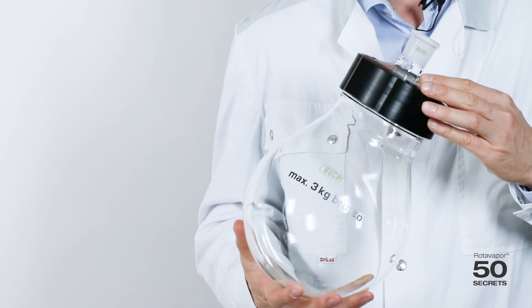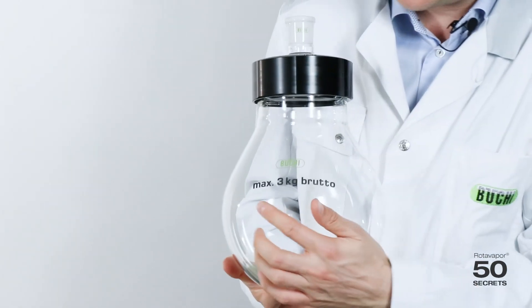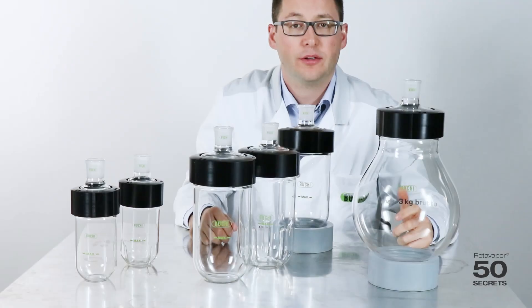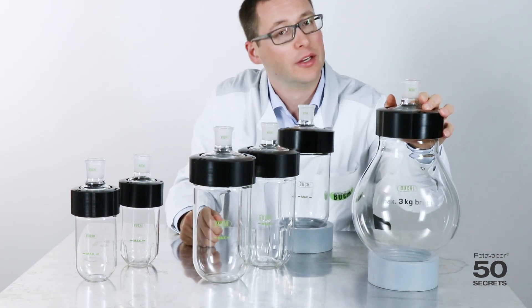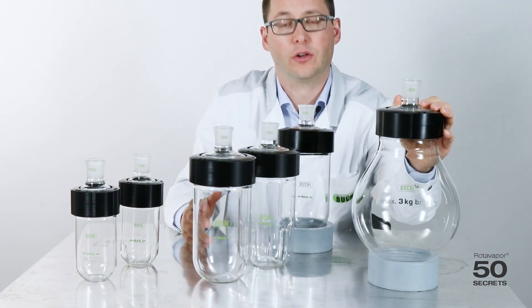Last but not least, the 4 liter beaker flask. The one thing you have to take care of is that you don't go beyond the 3 kilo gross weight. That's it about the beaker flasks. My personal favorite is the 4 liter one — just enough volume, looks great, and works fantastic on the R300.